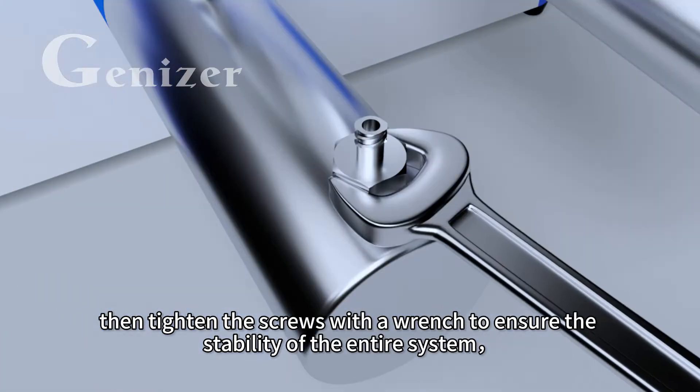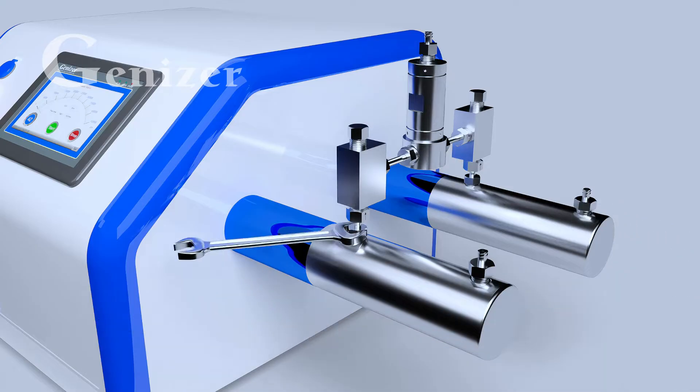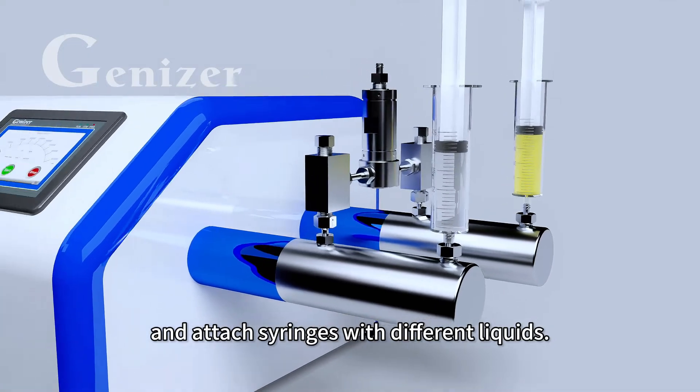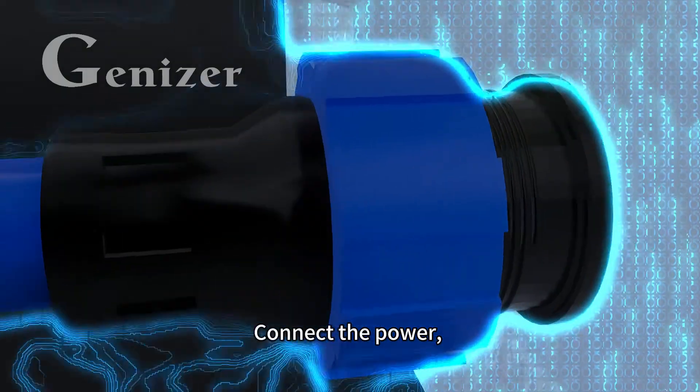Then tighten the screws with a wrench to ensure the stability of the entire system, and attach syringes with different liquids. Connect the power.